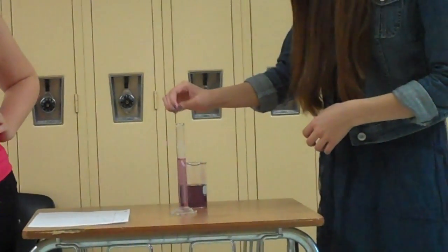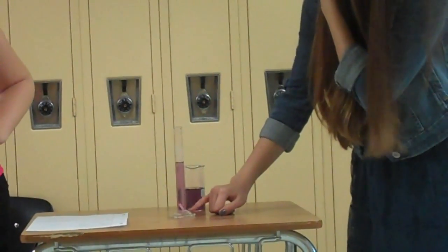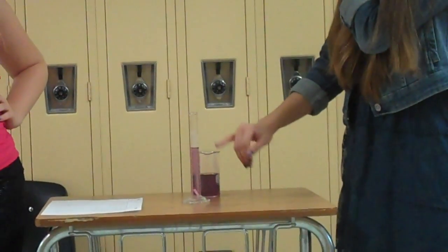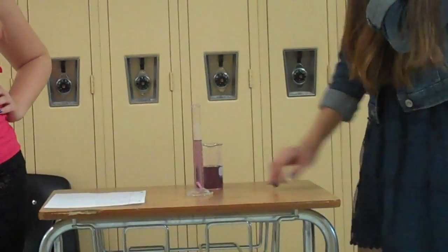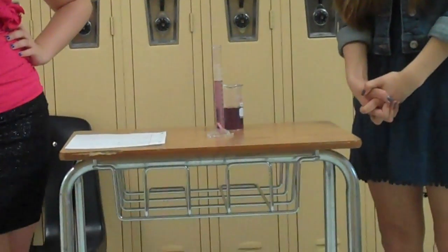And I'll put my little eraser in there. So you can see when you put something in there, it displaces the water, and you can measure how much it's displaced. And that is how I use the graduated cylinder.